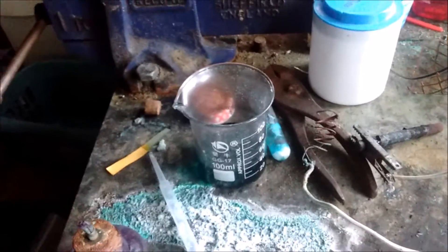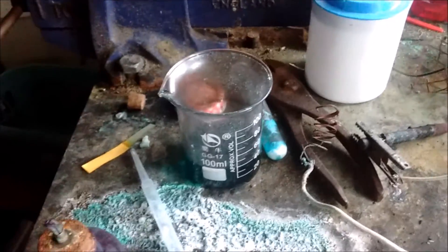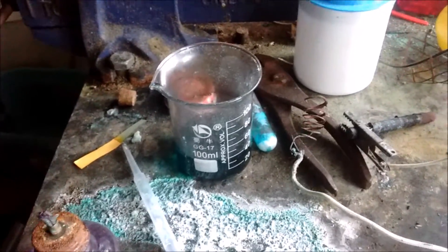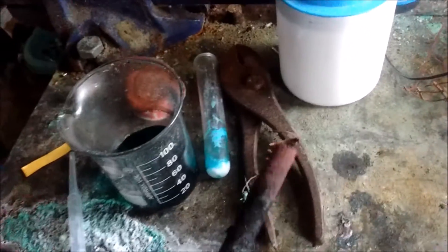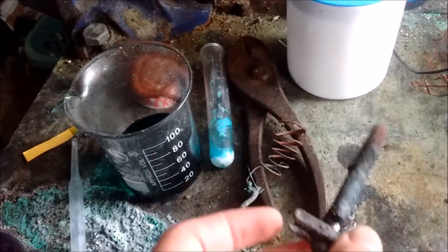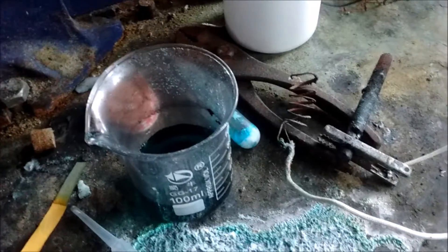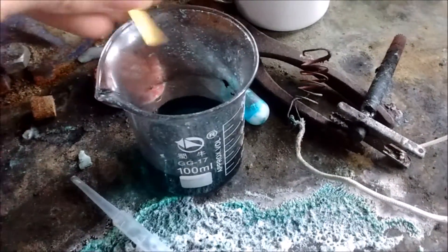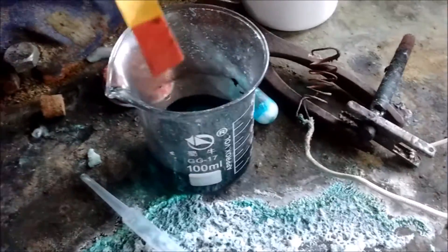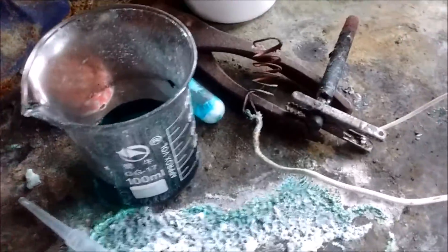I've been electrolyzing it for a few days now and it's got to a stage where the resistance is so high that I'm unable to do any more. I also may have accidentally wired it the wrong way around because I've got copper on the graphite electrode, which may or may not have affected it. But anyway, it's still fairly strong — if I stick some indicator paper in, it goes very red. So it's definitely a strong acid.